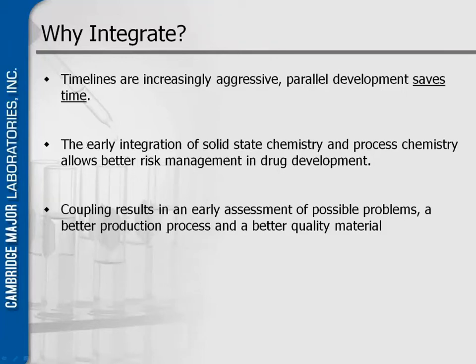Why should you have an integration? Well, the timelines are shortening each time, and parallel development of both your solid state chemistry and your process development saves time. I will show a small graph in the next slide.